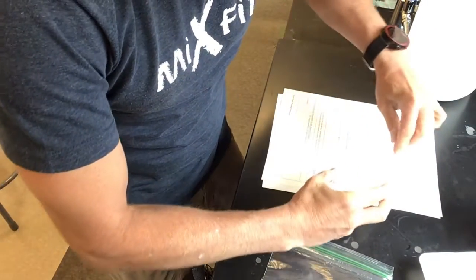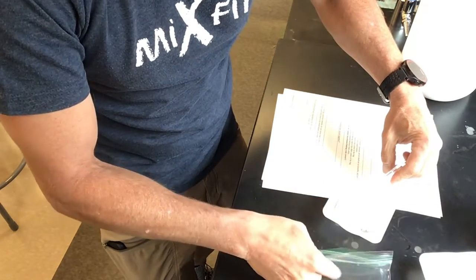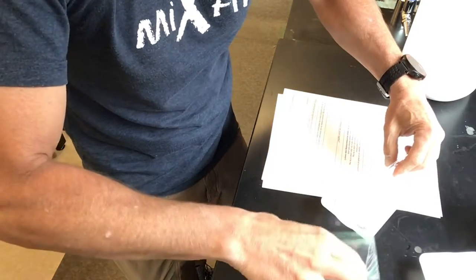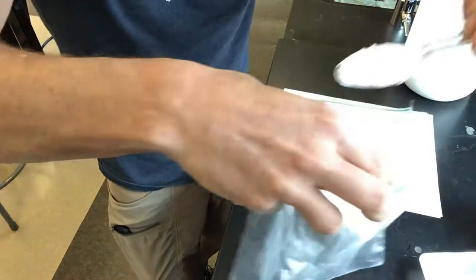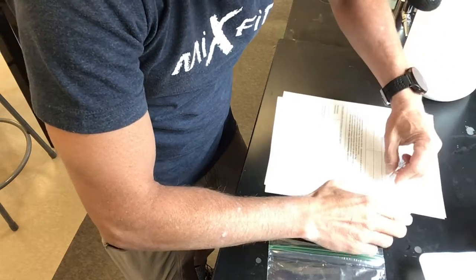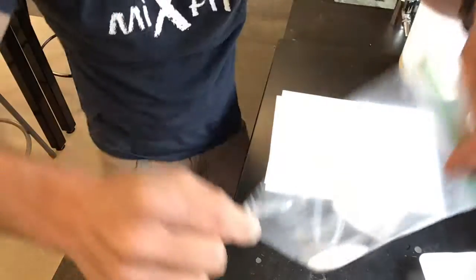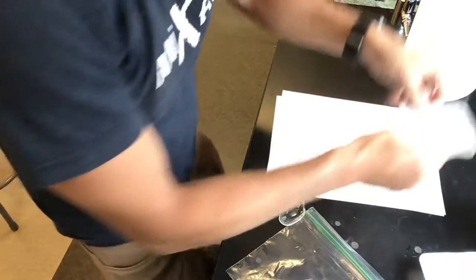Again, you will be doing this yourself in trials. So here's 1.5, and I'm going to put it on one end of the bag.